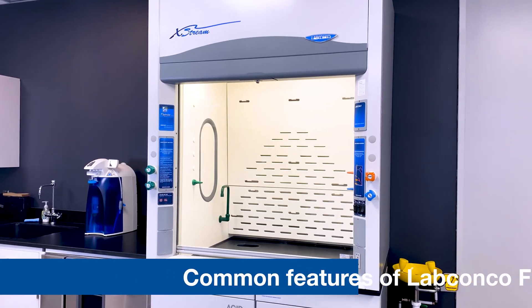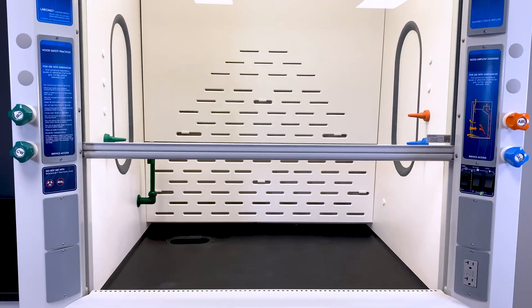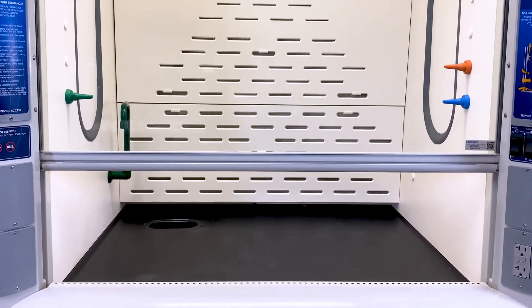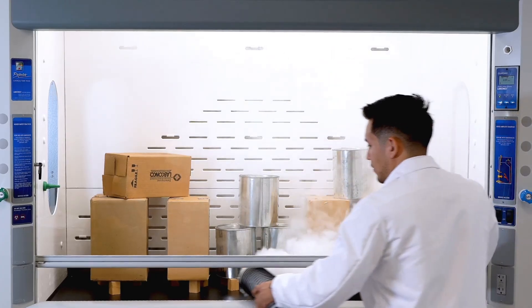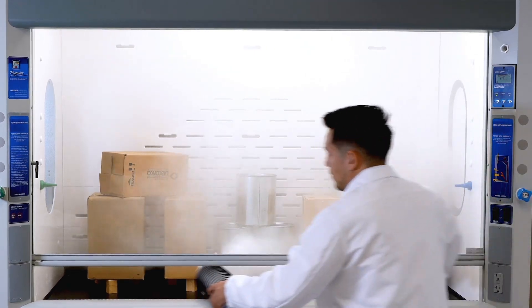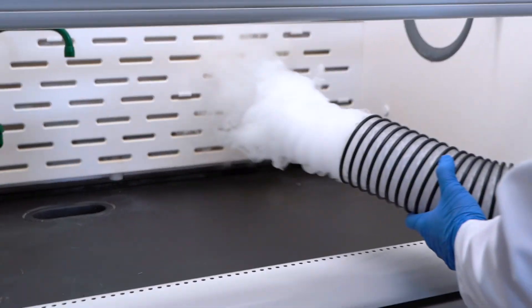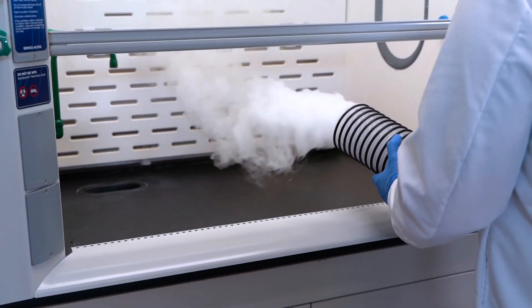Let's briefly define the common components found in LabConco fume hoods. The sash is the glass barrier at the opening of your fume hood and acts as a physical barrier to what is being contained on the inside of the hood. Baffles are panels located at the back of the hood and are designed to direct airflow back and away from the user.